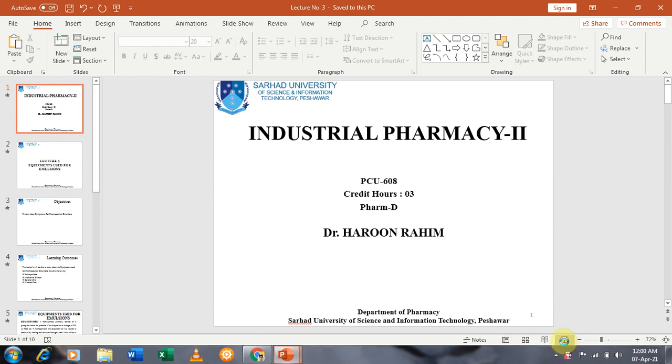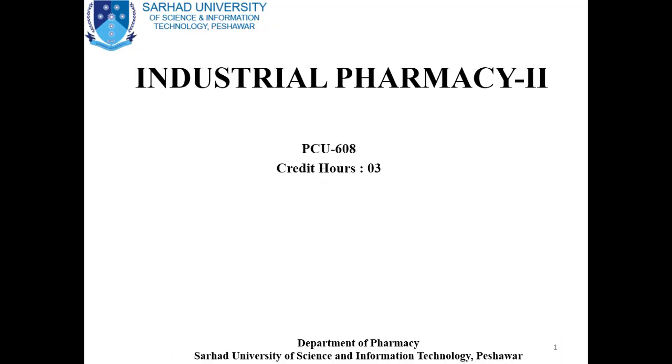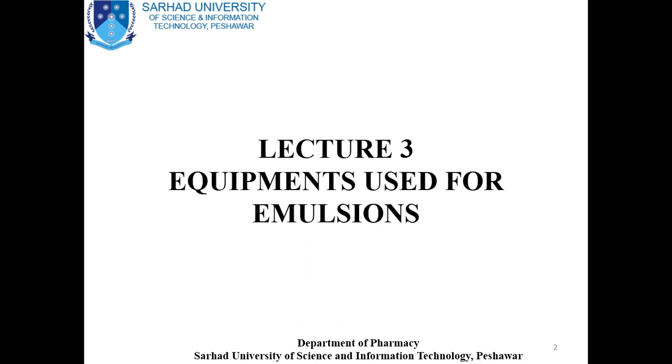As you know, today is the first class of the week, and today's lecture we will discuss equipment used for emulsion.